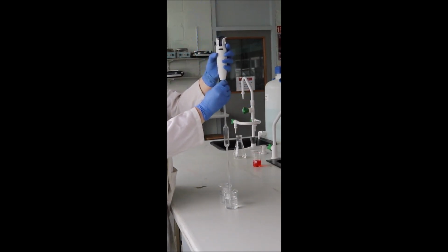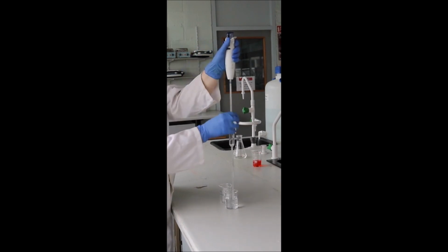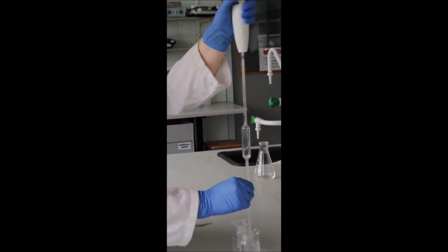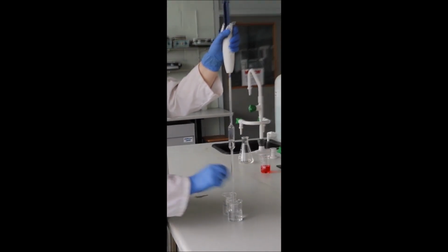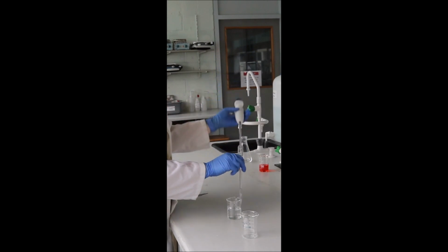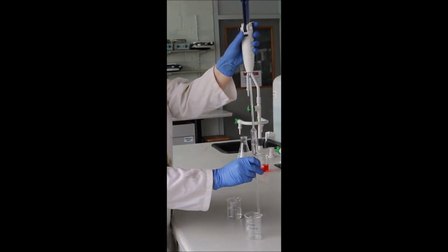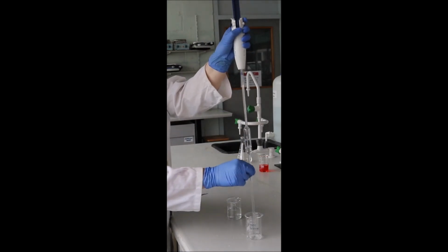You can now rinse your pipette with distilled water by placing it in a beaker and drawing up a small amount of water as shown here. I have about half filled the pipette, as you can see here, and I'm going to rinse into a second beaker. I gently rotate the pipette to make sure I rinse all the sides of the pipette, making sure that I don't get liquid into the pipette filler which could damage it, before I empty the pipette into the waste beaker.